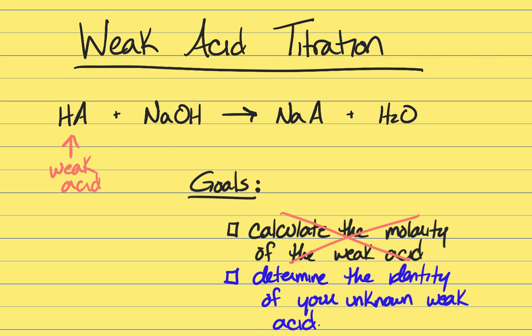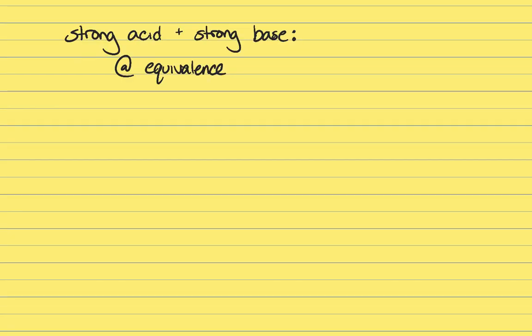So what I'm going to do over the next couple of minutes is explain a little bit about how you're going to do that, and again, show you some visuals from the lab procedure that I did to help you get ready for the analysis that you're doing this week. So first, let's do a little comparison with the strong acid, strong base titration that you did in 10th grade.